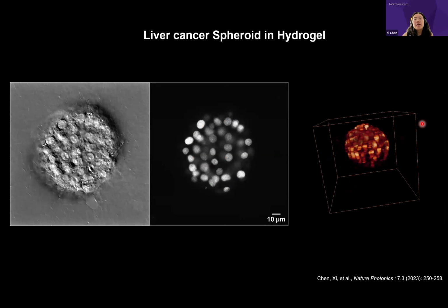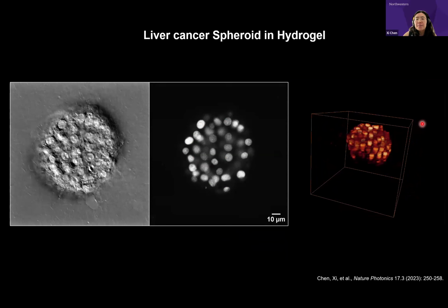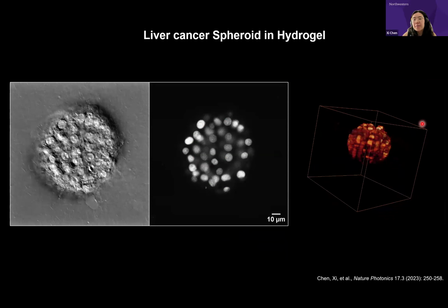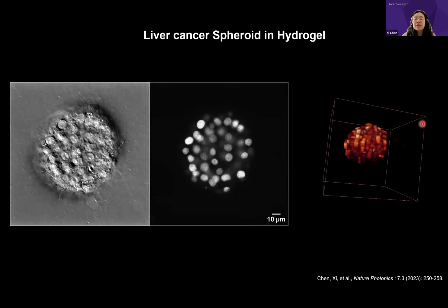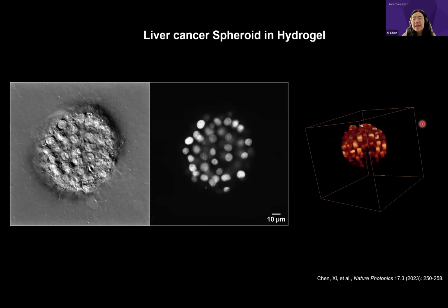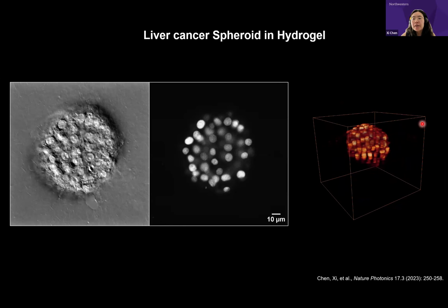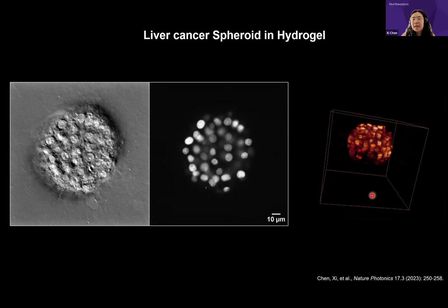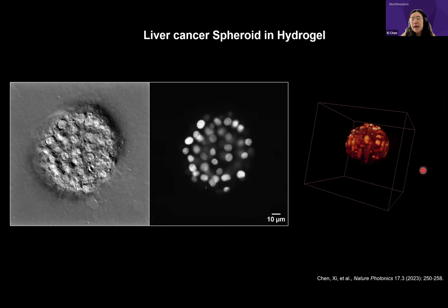The network that we trained on used spheroids in PBS, and those are pancake shaped. It's not very spherical, but when you put the spheroid in the hydrogel, they will tend to grow into a more spherical shape. We never trained the network on the samples that grow in the hydrogel. However, our network can still pick up this spherical shape of the spheroid that grows in the hydrogel.